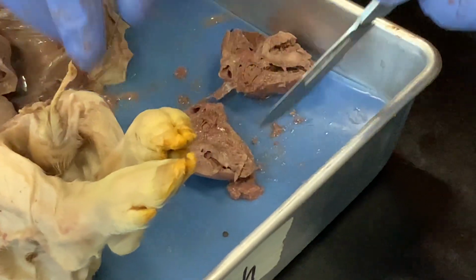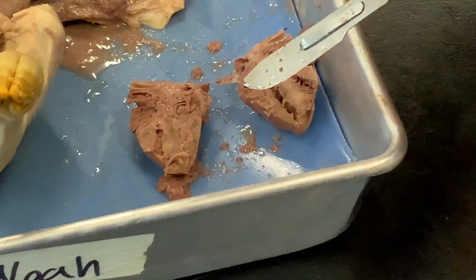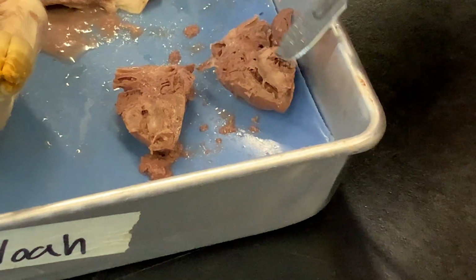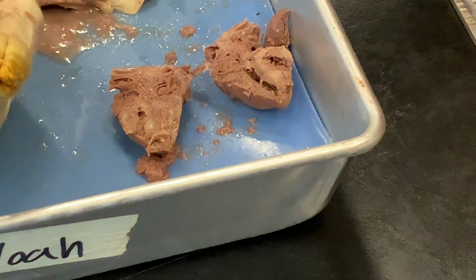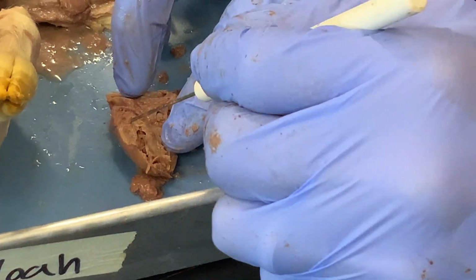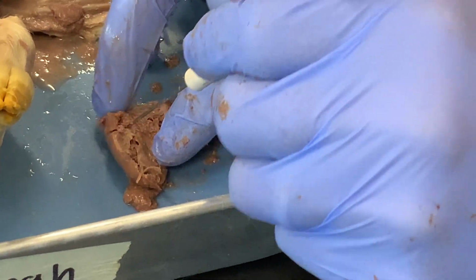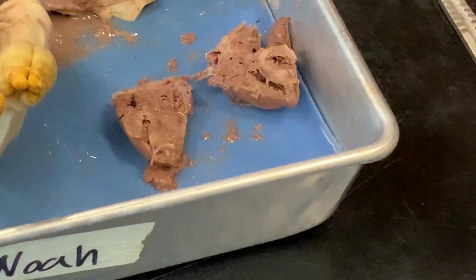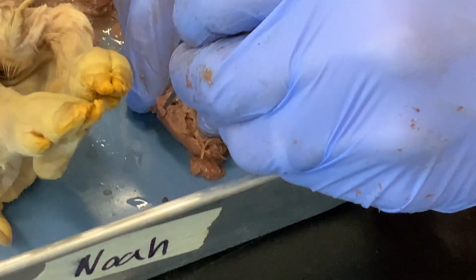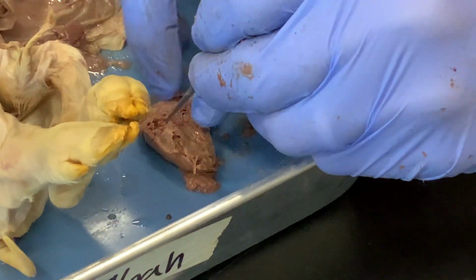So here we are now looking towards the back of the heart here. So this is our ventral view, and this is the dorsal view as if we were looking through the back of the animal. There is blood coagulated inside the chambers that I will try to remove some of so that you can see that it is actually an empty space in the muscle.